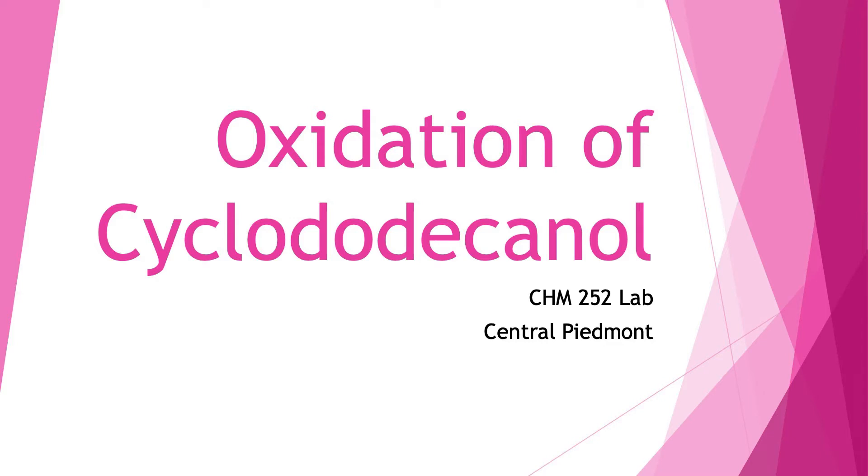In today's lab we're going to do an oxidation of cyclododecanol, which is a secondary alcohol.